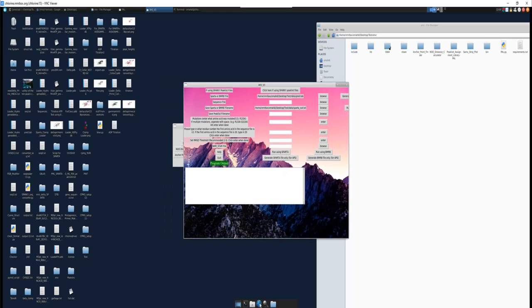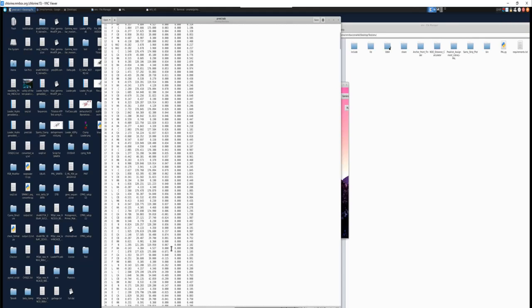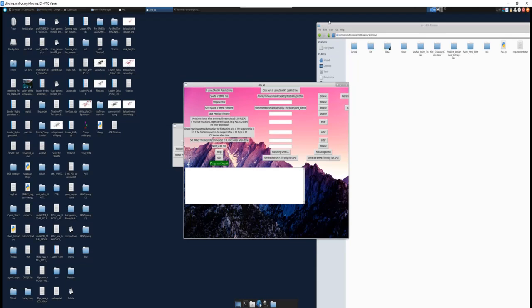Now, in many cases, you're not going to potentially be assigning the entire protein in your Sparta Plus file. Maybe you're assigning only a particular domain. Maybe you're assigning a little bit less, a particular part of that protein. So the Sparta Plus file may have extra information that you don't need. Additionally, you may have mutations that deviate from your Sparta Plus file, from the PDB. So what you want to do as well is upload your sequence file, right?